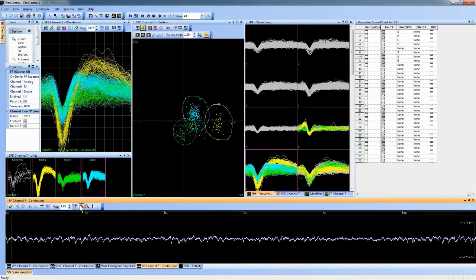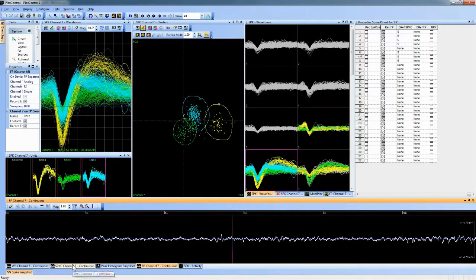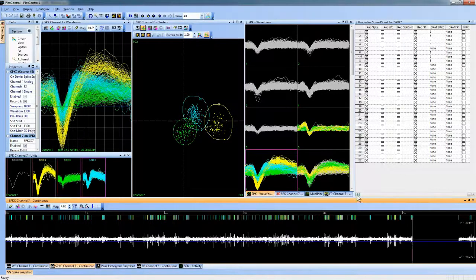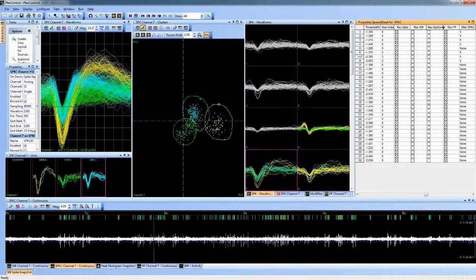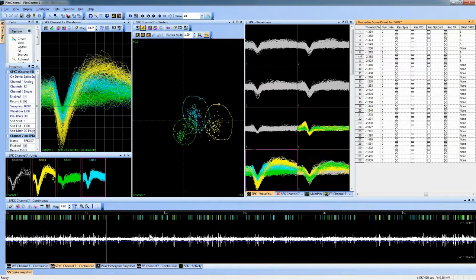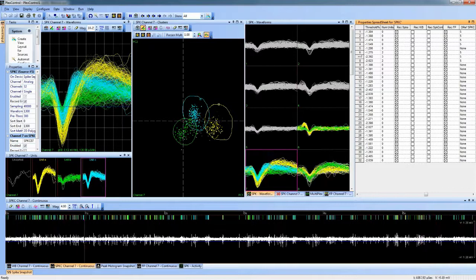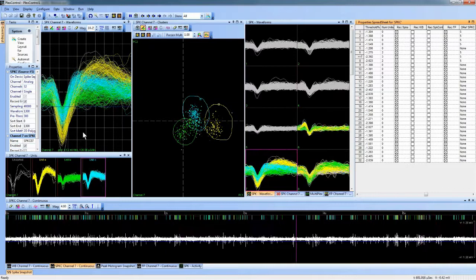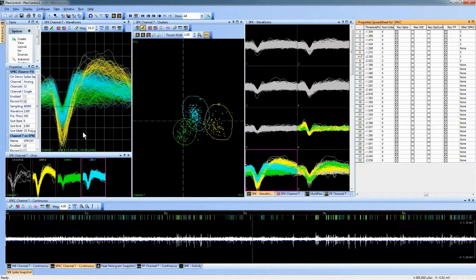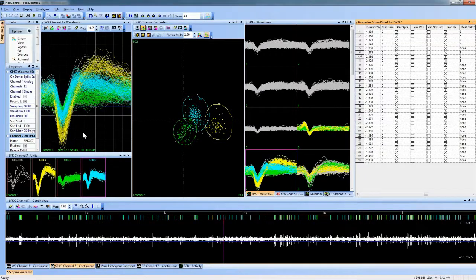Yes, absolutely. So one important thing to know, though, is if you want to re-threshold data offline, you have to be sure to save this continuous spike data. There's an option up here in our properties spreadsheet to record the spike continuous data. What this means is that you can select on a per channel basis whether or not you're going to record this continuous spikes. The reason that has to be recorded is if not, then all that's being recorded is just what's crossing the threshold. And if you adjust the threshold offline, you want to know what's maybe slightly before or slightly after your incorrect threshold setting. So you're able to get more or less or different parts of the waveform.